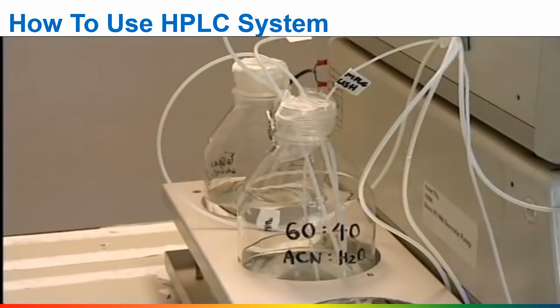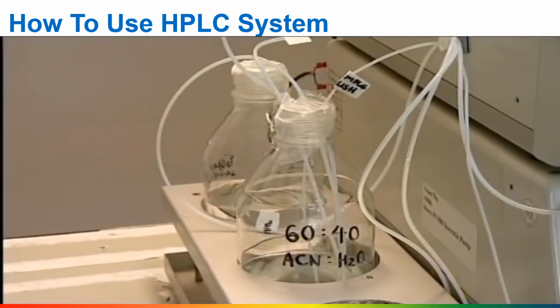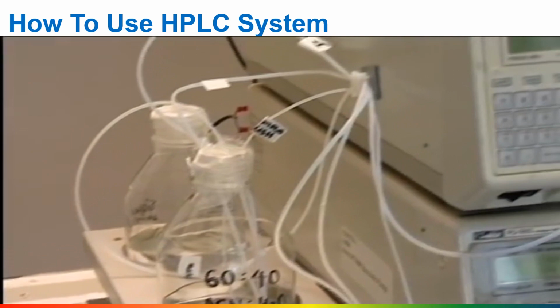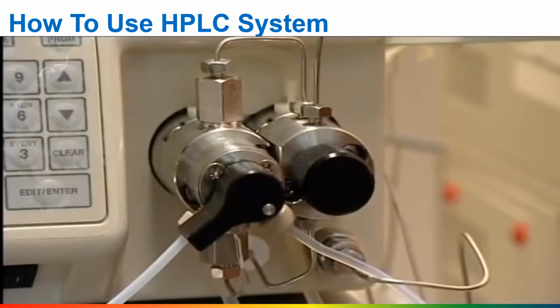In this case, one solvent is water, very polar, and the other, ethane nitrile, less polar. The operator can decide on a mixture with the correct polarity for the separation she is doing. These are the pumps. They produce a pressure of 15,000 kilopascals, 150 times that of the atmosphere, hence the name, high pressure liquid chromatography.